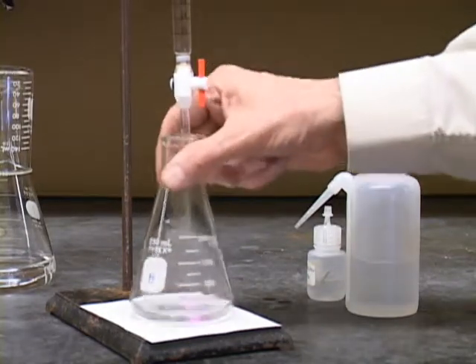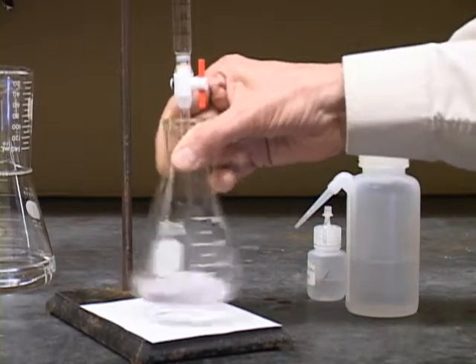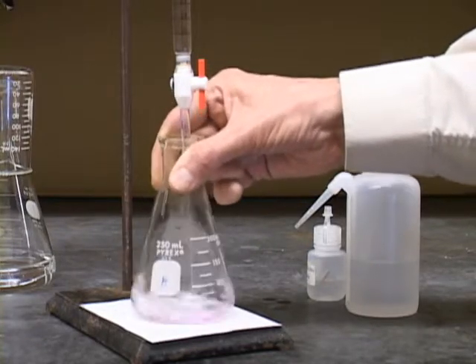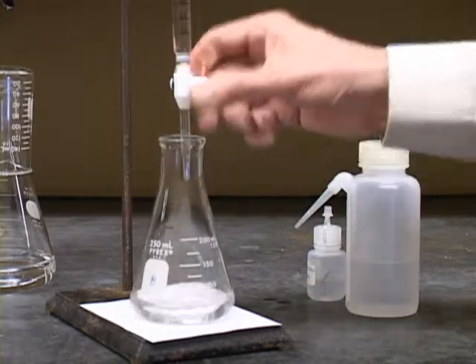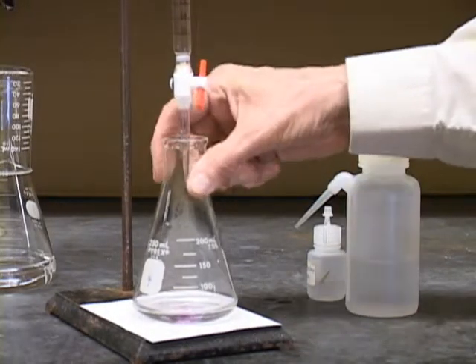We'll add it fairly rapidly at first, but we need to do that with lots of swirling here so it gets mixed thoroughly. And as you can see, there's just a faint pink spot being formed even now. We'll get a bigger pink spot there, so I think we'll slow this down. And now we'll add it only dropwise. Drop, drop.